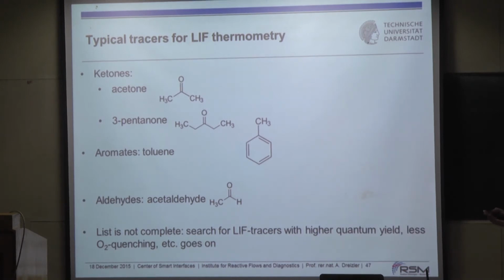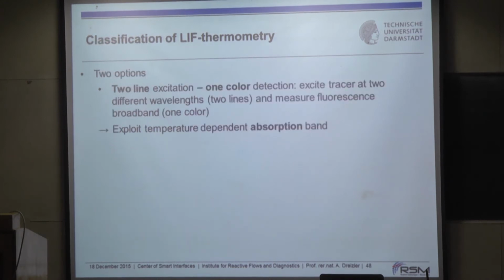The excited energy is quenched by the collision with oxygen. So oxygen quenching can be a showstopper. Okay, so there are different options.